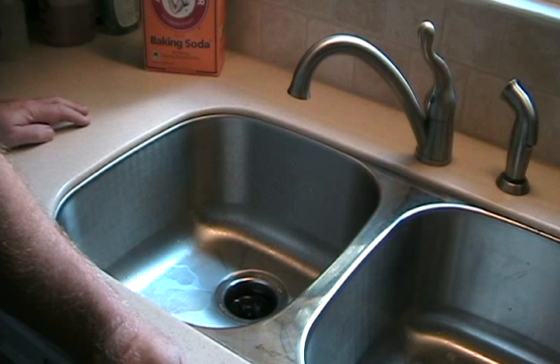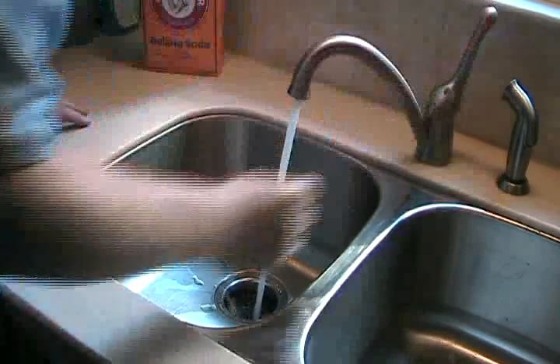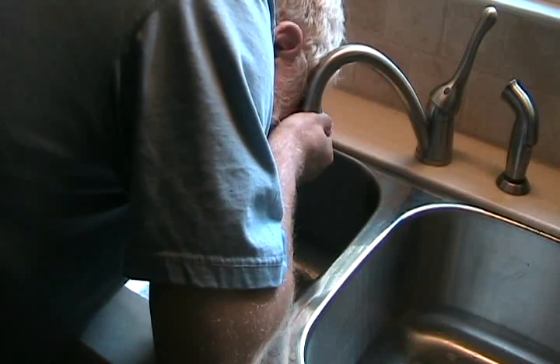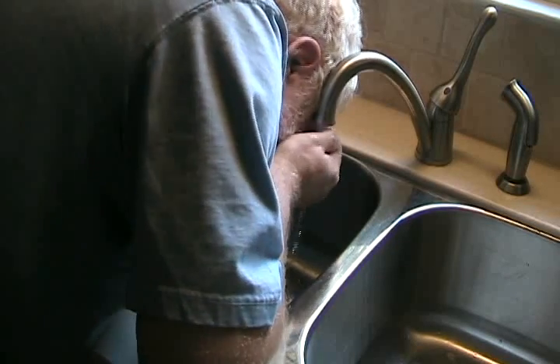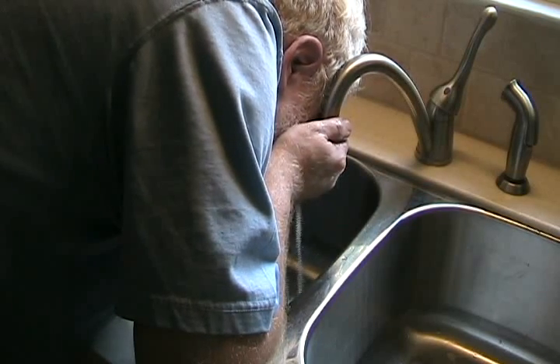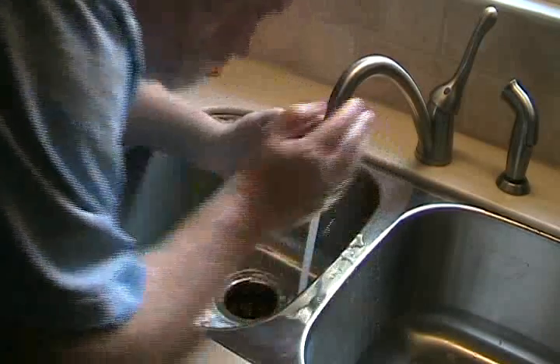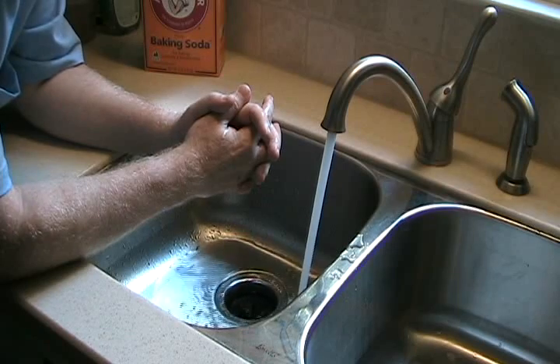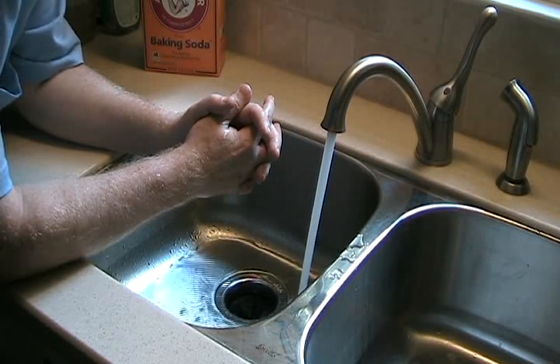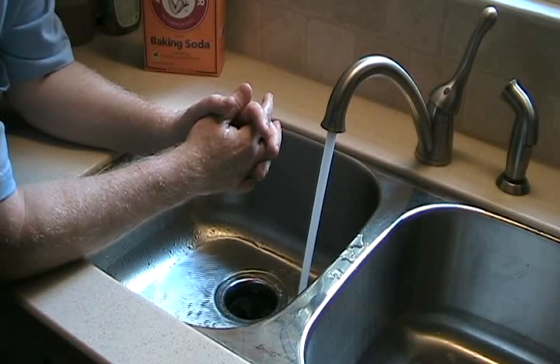Let's say the unthinkable happens. You get acid, a base, or another corrosive substance in your eyes — either because you weren't wearing goggles, or because your goggles weren't sealed tightly, or they failed for some reason. What do you do? You immediately rush to the sink, turn on the cold water full blast, and you do this: cup your hands and keep the water flowing. Try to open your eyes — you may have difficulty, it may sting — but you want to get as much cold water into your eyes for as long as possible, for at least five or ten minutes, until you've washed all the toxic or corrosive material out of your eyes. This is why it's a really good idea to have a second responsible person present in the lab when you're working. Because if you do get something in your eyes, you may not be able to see the sink. You may be in such pain that you can't figure out which way is up. So always work with another person, if not in the lab with you, at least within easy earshot.